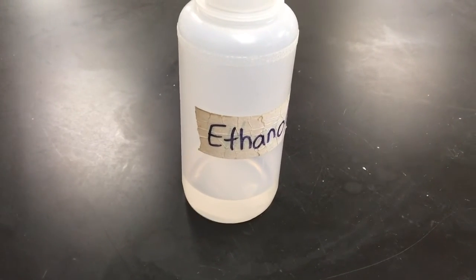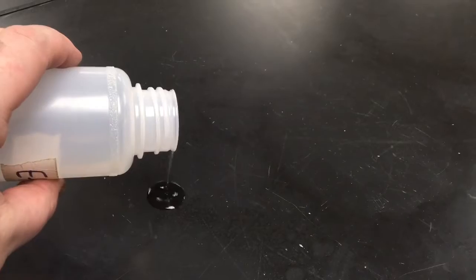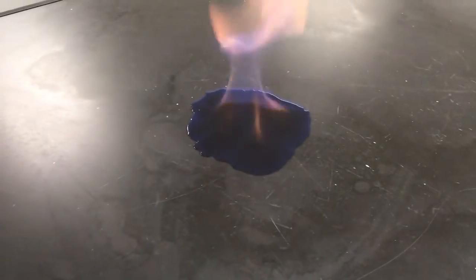Here at station number 2, we have some ethanol. And I'm just going to put some on our lab table and ignite it for you.